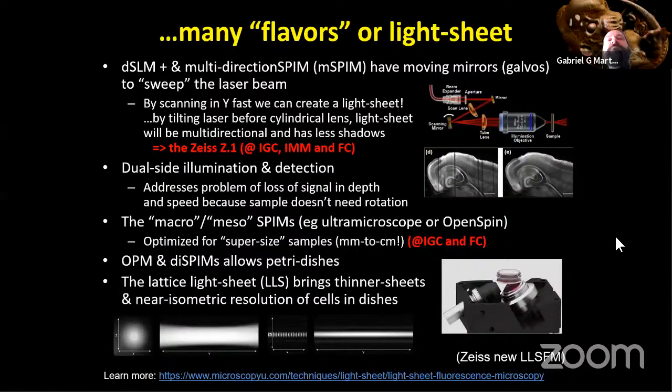Now, there are many, many flavors of light sheet microscopes these days. Today it's a jungle of different systems, and there are many different commercial versions of it as well, and different levels of samples that you can image with light sheet microscopy.